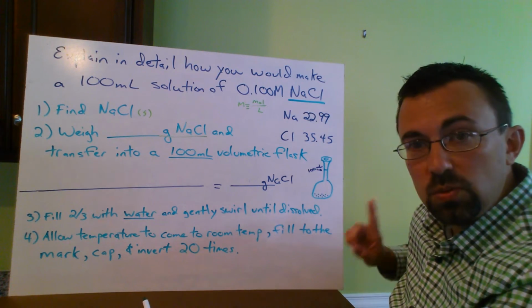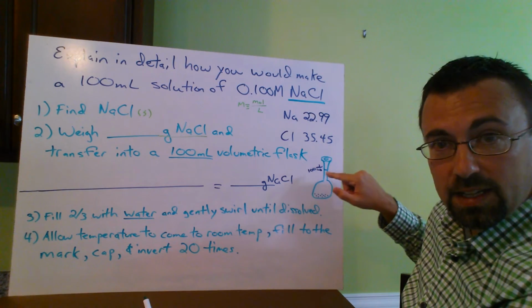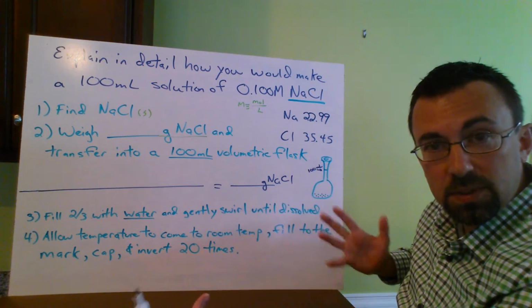They are designed to do one volume and one volume only. They will have a little mark somewhere, usually very light, etched into the neck. Sometimes it's higher and lower, even from the same company in the same box.